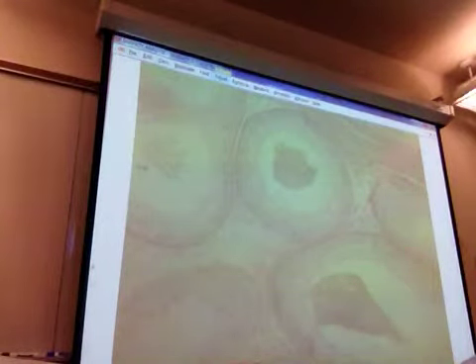But you can definitely see all those cilia, or stereocilia. If it's been a while since you looked at the epithelia, look at them, for both this and the uterine structure, so the female reproductive system too, so that you can remember it.